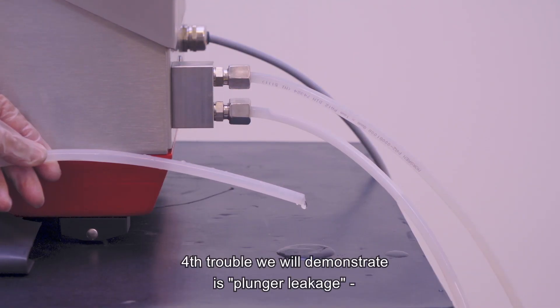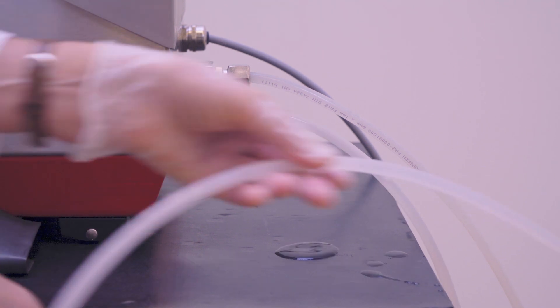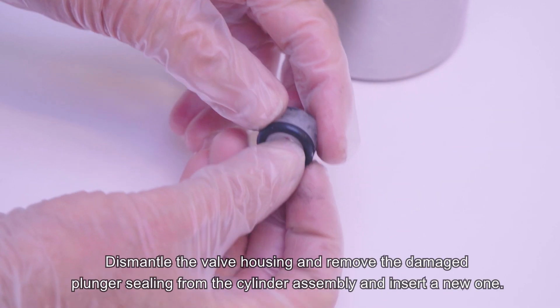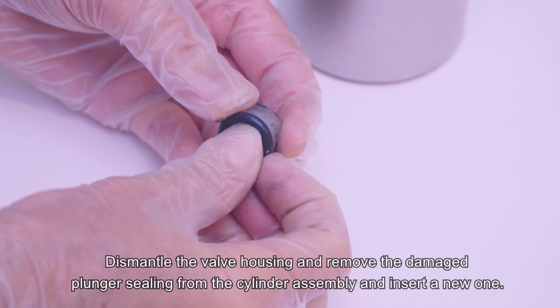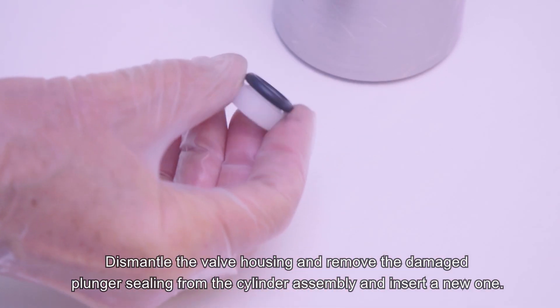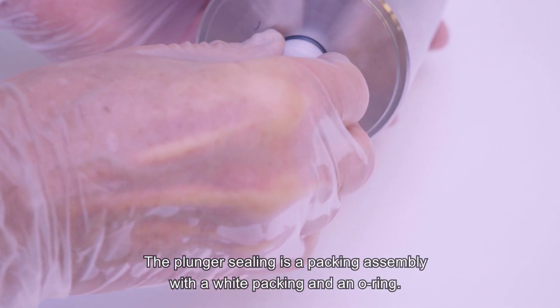The fourth trouble we will demonstrate is plunger leakage, where the product is observed leaking into the outlet with lubricating water. Then the plunger sealing must be changed. Dismantle the valve housing and remove the damaged plunger sealing from the cylinder assembly and insert a new one. The plunger sealing is a packing assembly with a white packing and an O-ring.